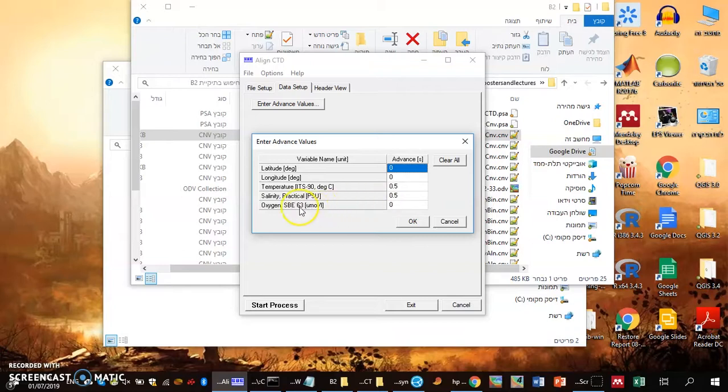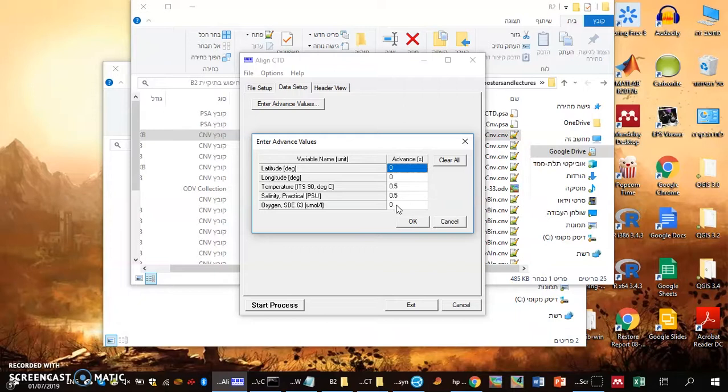For oxygen, it's a chemical process we are measuring, which takes time. Here we enter an advanced value of 5 seconds. You have it on the Seabird manual, what's the advised advanced value, and that's 5 seconds.